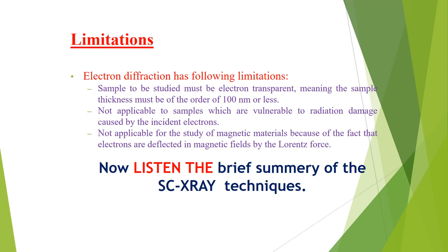The sample is illuminated with monochromatic radiation, and the sample axis phi and the goniometer axes omega and 2 theta are rotated to capture diffraction spots from at least one hemisphere. This technique is easier to index and to solve the crystal structure because its diffraction peaks are uniquely resolved.